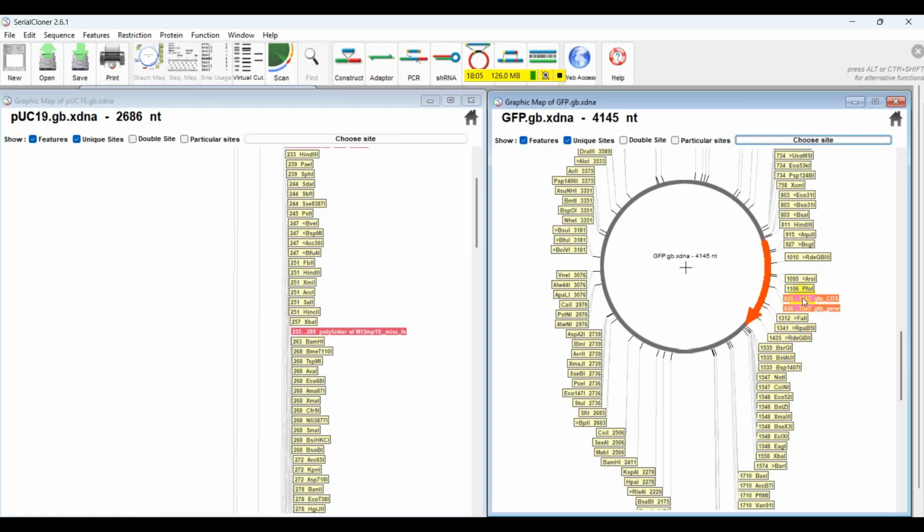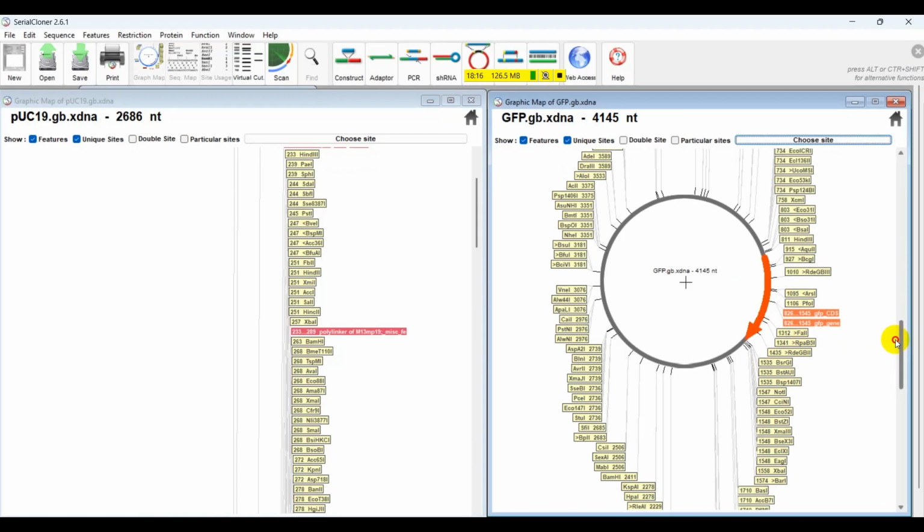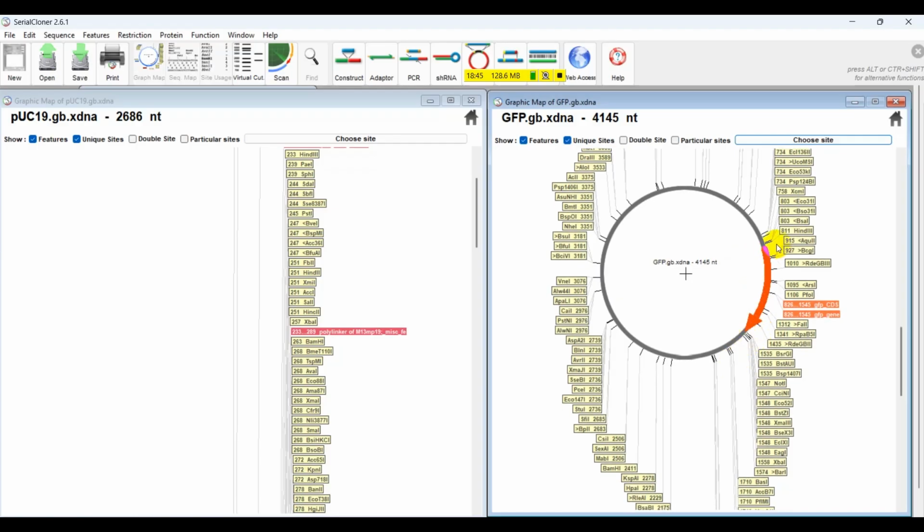এখানে একটা লক্ষণীয় বিষয় যে এখানে দেখো যে কোডিং সিকোয়েন্স, জিএফপি জিনের কোডিং সিকোয়েন্স হচ্ছে 826 থেকে 1545 বেস পেয়ার পর্যন্ত। হ্যাঁ, সরি, নিউক্লিওটাইড সিকোয়েন্স পর্যন্ত, যেখানে টোটালটা ছিল 4145 নিউক্লিওটাইড। সো 826 to 1545 nucleotide sequence is the main GFP gene sequence region, and whereas the total GFP with plasmid was 4145 nucleotide. So here we need to cut from here and here.